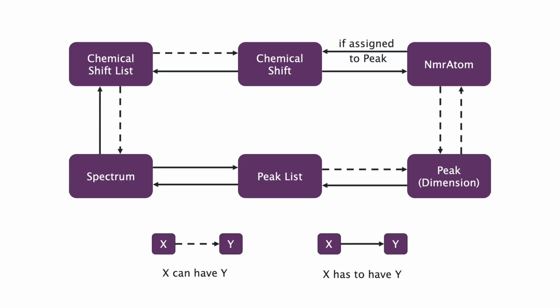It's also worth pointing out that if you have spectra whose chemical shifts you don't really need to document anywhere, or where you would rather they don't contribute to the chemical shifts you want to deposit in the BMRB, you can just have a dumping ground chemical shift list. All your dynamics data, for instance, your RDC spectra, your paramagnetic relaxation enhancement spectra, those don't need to feed into the chemical shift list from your assignment spectra that you want to deposit with the BMRB. Just associate all those spectra with a chemical shift list you call unimportant, dumped, or random chemical shifts. And then those chemical shifts will be collected there, but not really used for anything else, and they won't mess up any of your statistics.